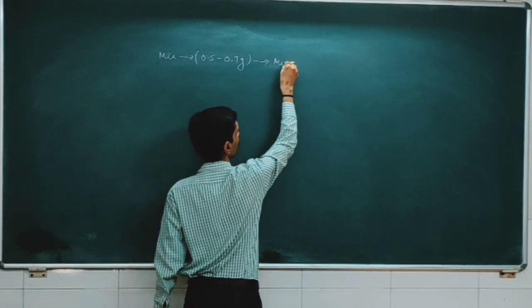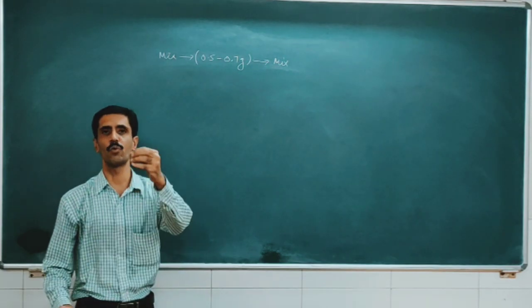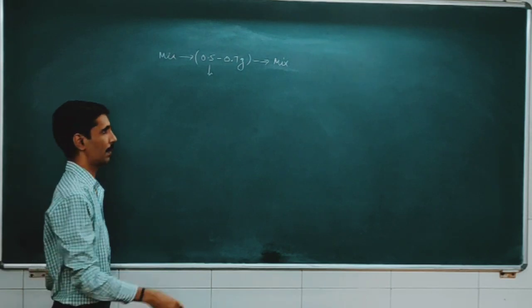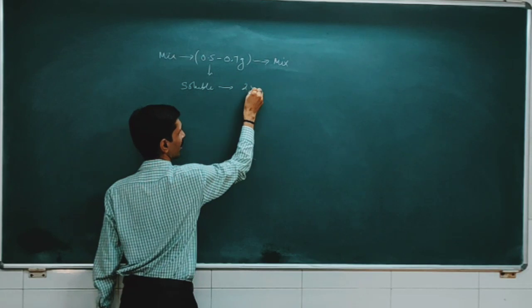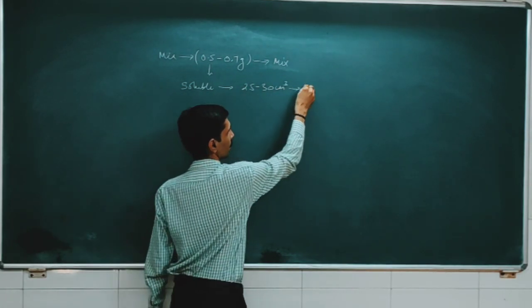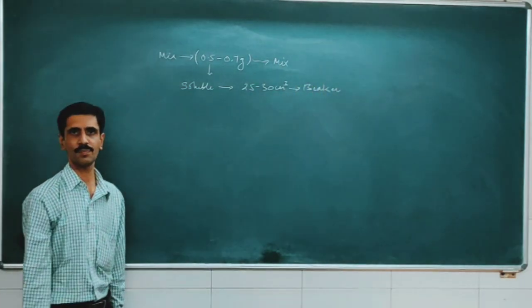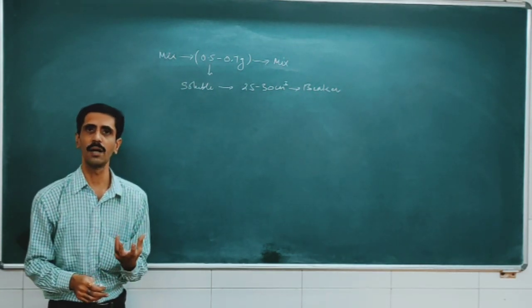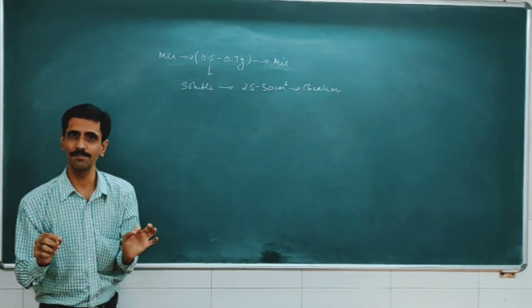Now, as I told you a few minutes back, the mixture has to be water soluble. So we need to make sure that it is soluble, and the amount of water should be in the range of around 25 to 30 cm3. This has to be done in a glass beaker. Once again, let it be on a watch glass. We are going to weigh the mixture. It should be in that range, but please record the exact weight.